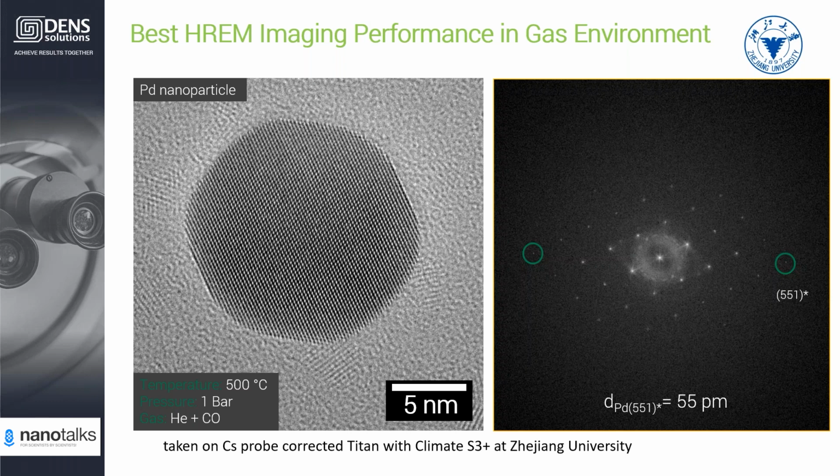And then you disperse this very dispersed solvent on your chip, and try to drop as much as possible. From our experience, the clean chips have a color reflection under the light microscope. But if you drop the solvent onto your chip, and with enough sample there, you will see the color reflection change to black.